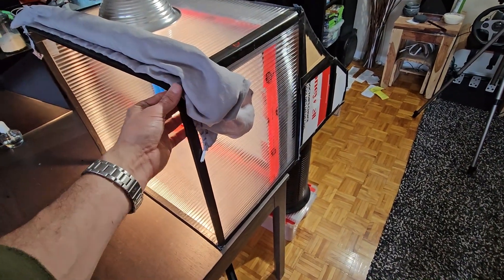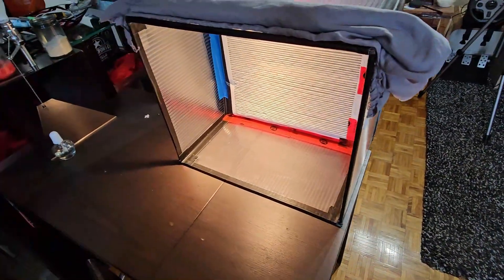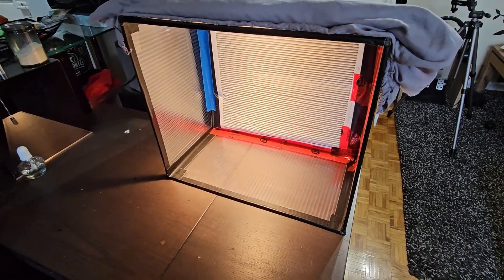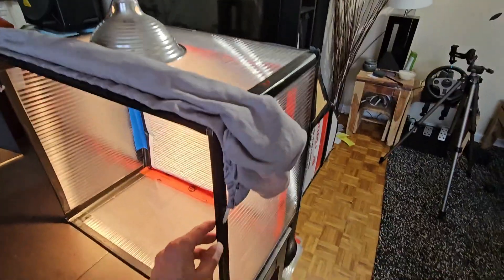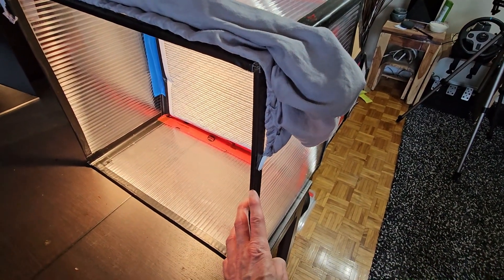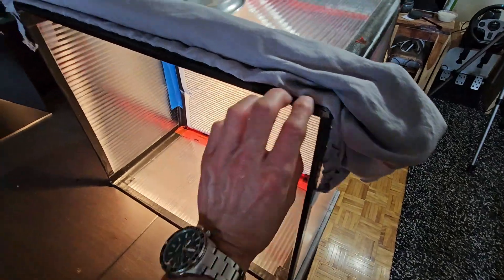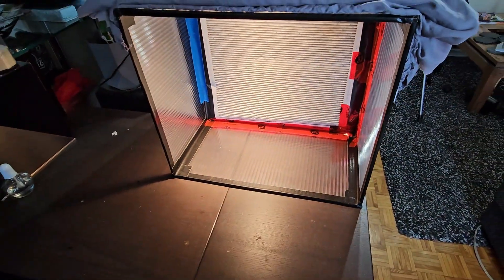This is a corrugated sheet of plastic from Home Depot that I cut with a knife to the specific size to work around the air filter. I use gorilla tape to tape the corners together, and because the corrugated plastic was open on the edges, I put tape around all the edges to seal it and keep bacteria out. It makes cleaning it pretty nice.